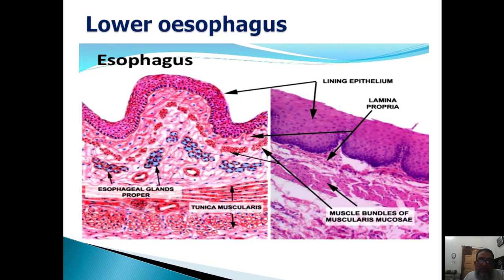Now look at a picture. So these muscles are smooth, the spindle-shaped muscle, central nucleus, in the form of a sheet. The outermost covering is the tunica muscularis, which is longitudinally cut. This is the longitudinal cut, this is the transversely arranged muscle fiber, and the outermost is the serosa.